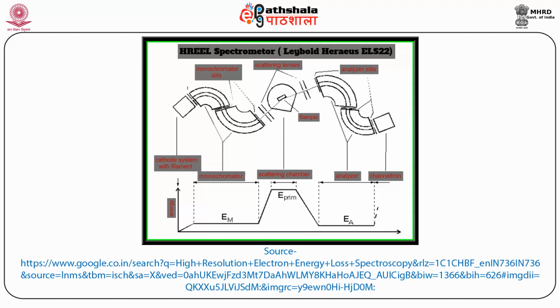To make the analyzer more accurate, especially to reduce the background of deflected scattered electrons, often two analyzers are used, or additional apertures are needed behind the analyzer, as scattered electrons of the wrong energy would normally leave the CHA under large angles. In this way, energy losses of 10 to the power minus 2 electron volts to 10 electron volts can be detected with an accuracy of about 10 to the power minus 2 electron volts.